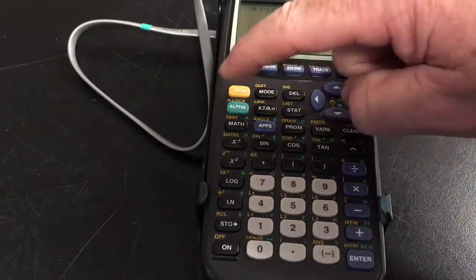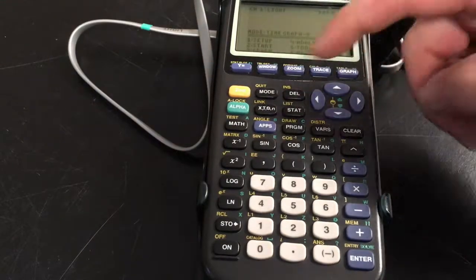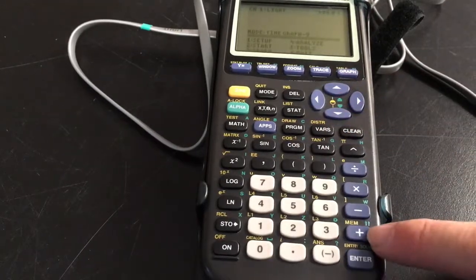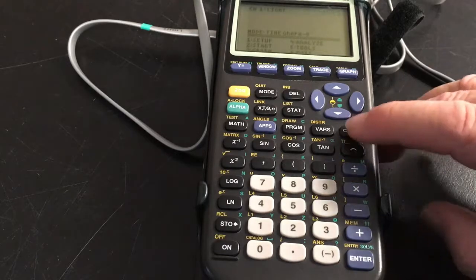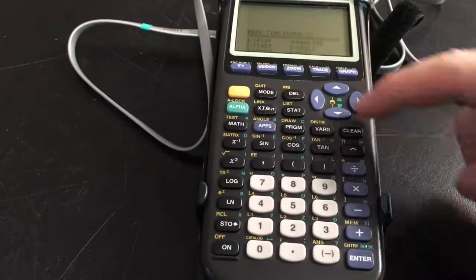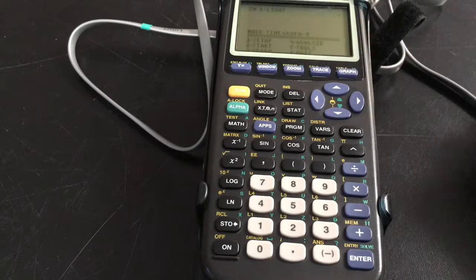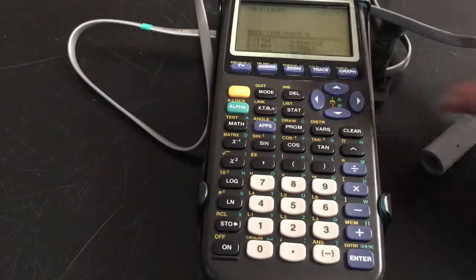Reset, we need to go second, because we want to use these yellow commands, and we want second, and down here we see memory, MEM. Actually, we've got to end this program first. So we clear, second, quit. Okay, it's checking sensors again, so it might work for us this time. Okay, it started working.